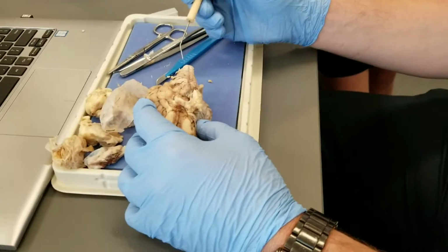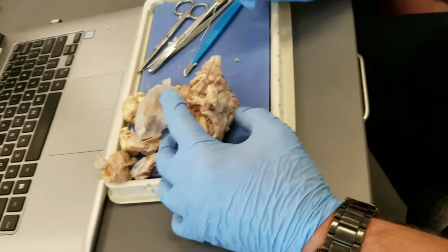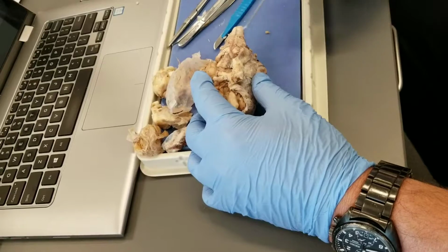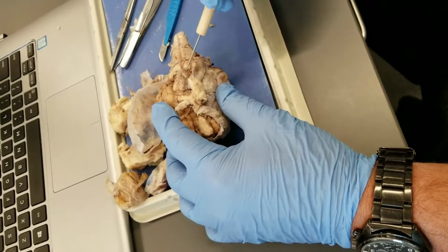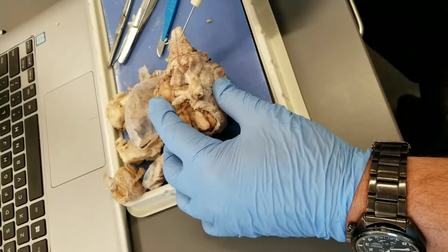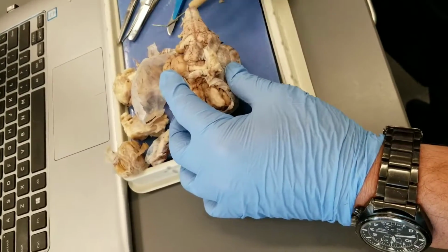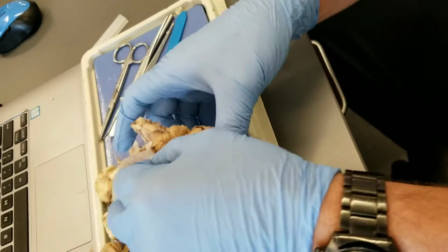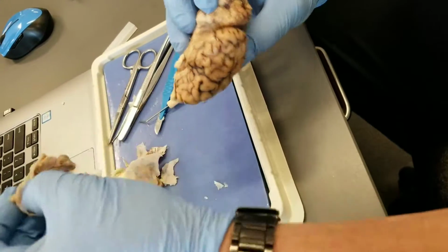Okay. So then the parts of the brainstem, there's three major parts of the brainstem we want to know: pons, medulla, and midbrain, right? Well, I think this protrusion here is pretty obvious. That's the pons. And then that's the pontine junction between the pons and the medulla. So this is medulla oblongata here. So let's identify the midbrain. Well, to identify the midbrain, it's best if you just do this. And we'll take that up there, a little indelicately now that I've identified everything.